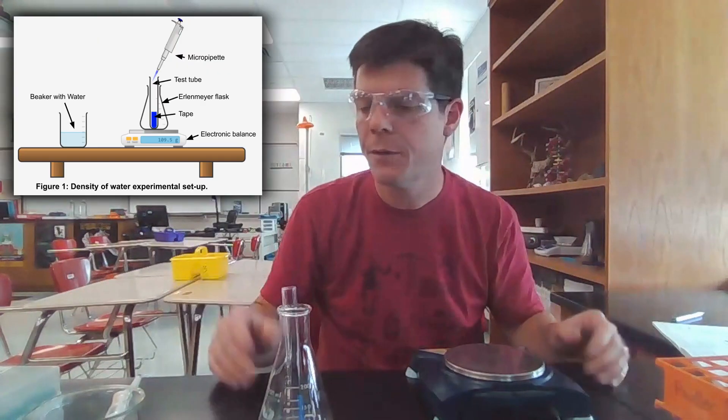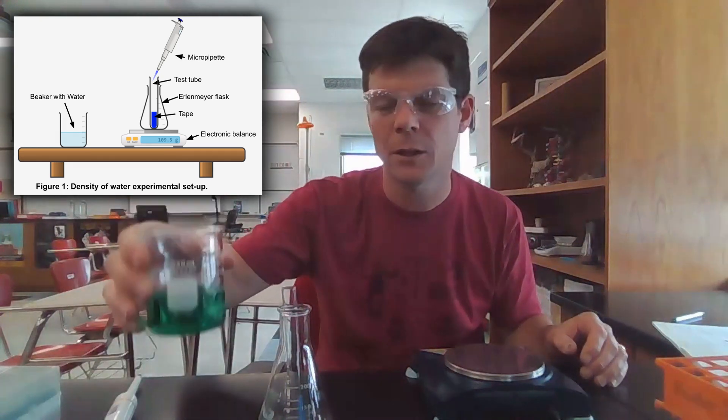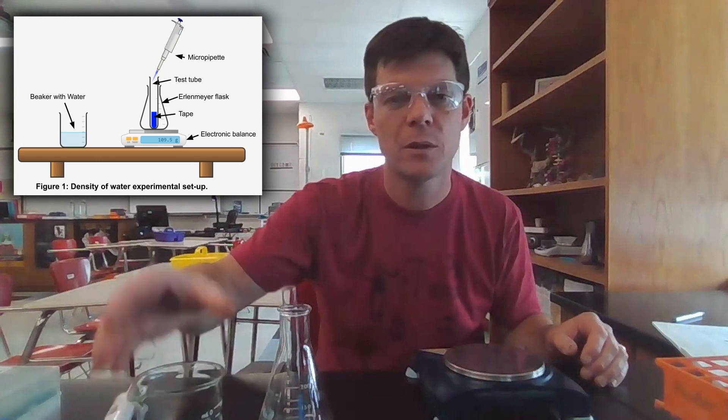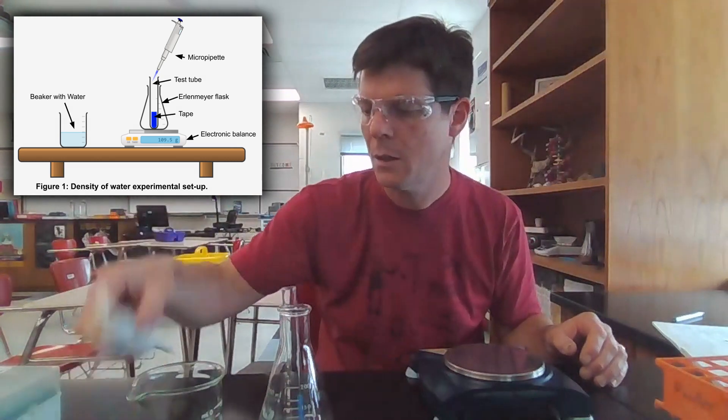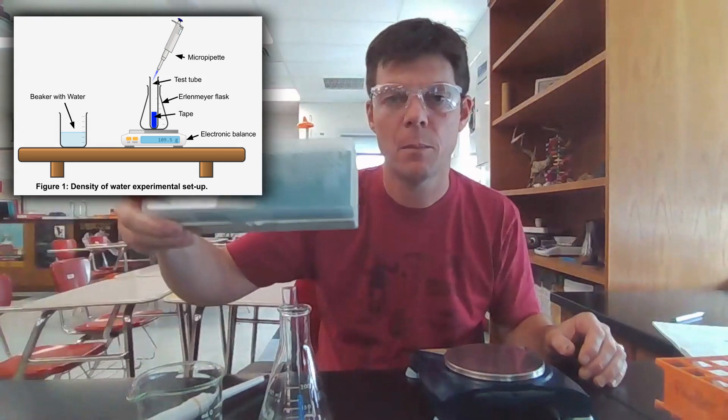You'll notice that I've added a piece of tape. We will be creating a graduated test tube. Other things that we're using for the experiment: I have a beaker with water. I've added a little bit of food coloring to it just to make things easier to see. I'll be using a micropipette, and then I have pipette tips.